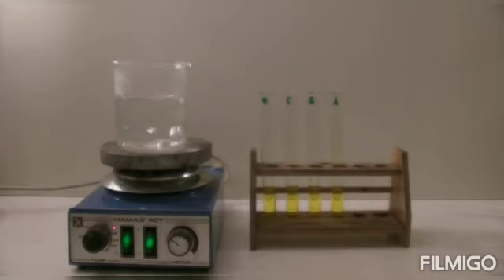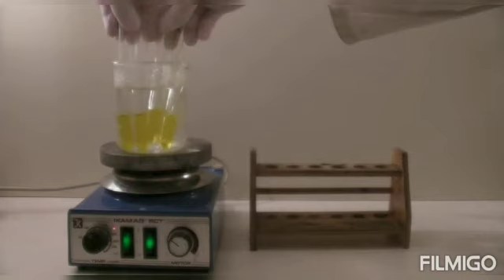Then we have to boil the water in a water boiling bath. Then keep those test tubes in the water bath for heating.